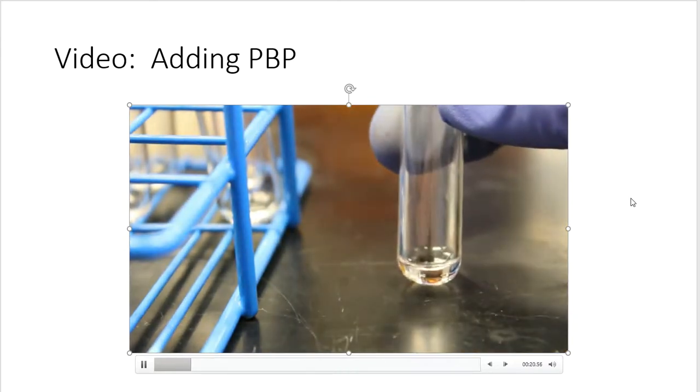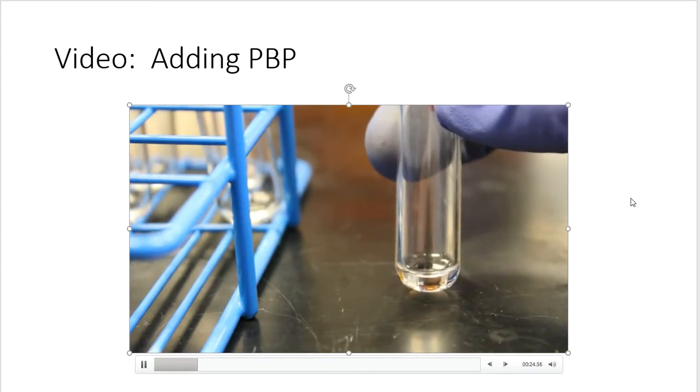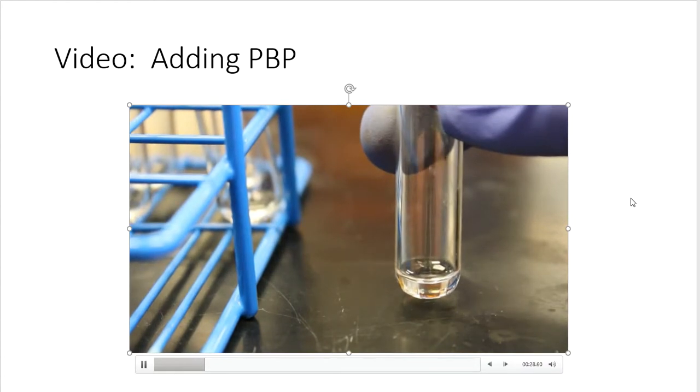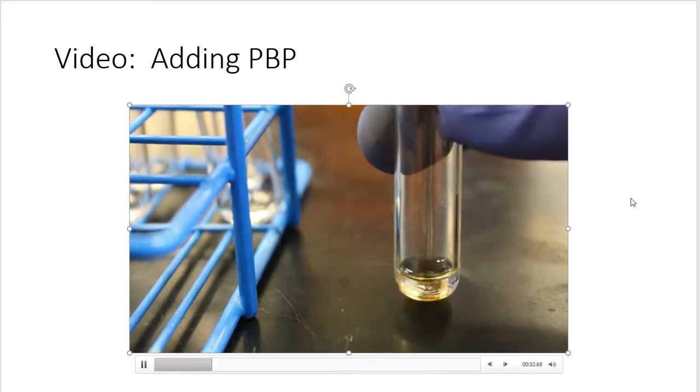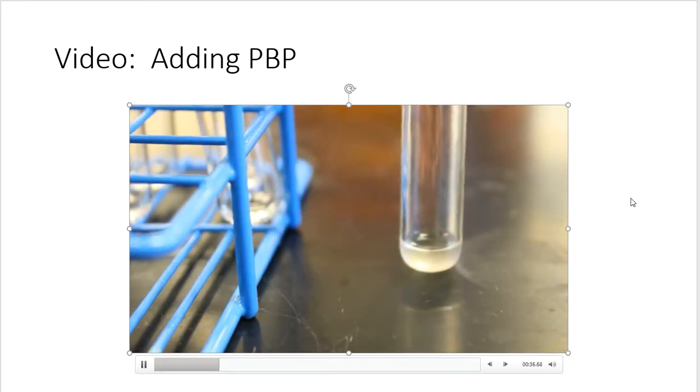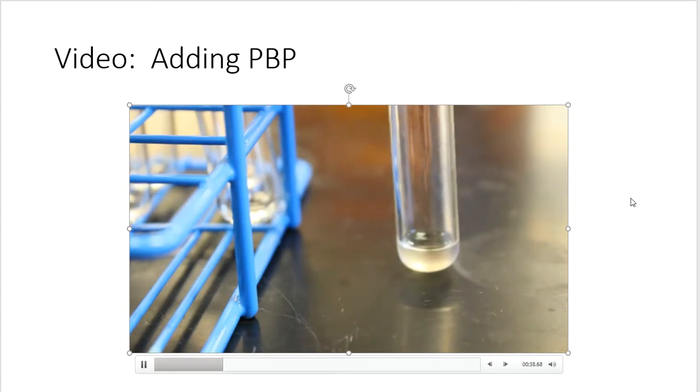All right, so here is a sample of octene. Octene's going to have 2 drops of PBP added. 1, 2. And now I'll shake, and what do you see?